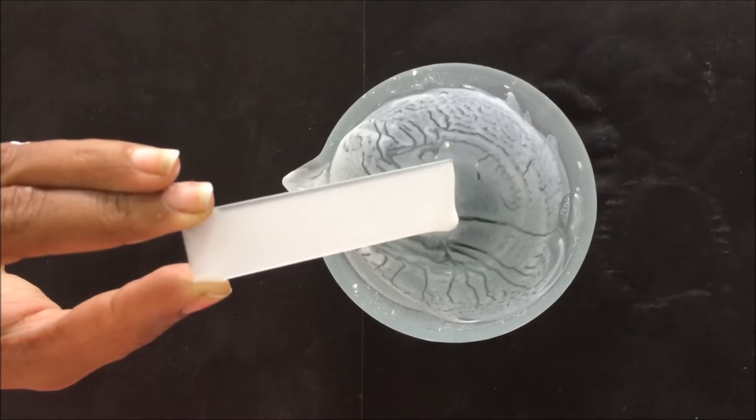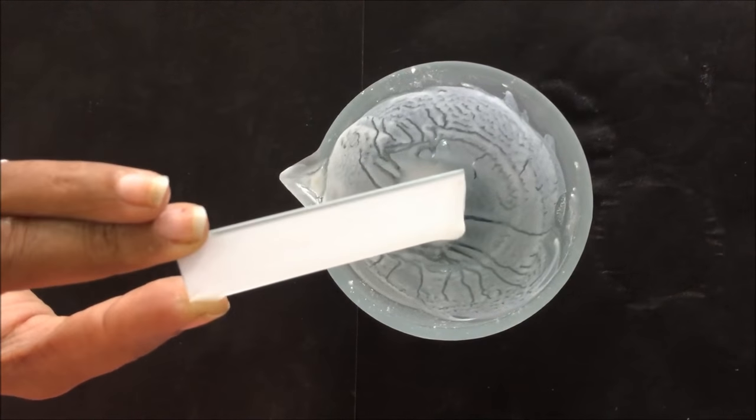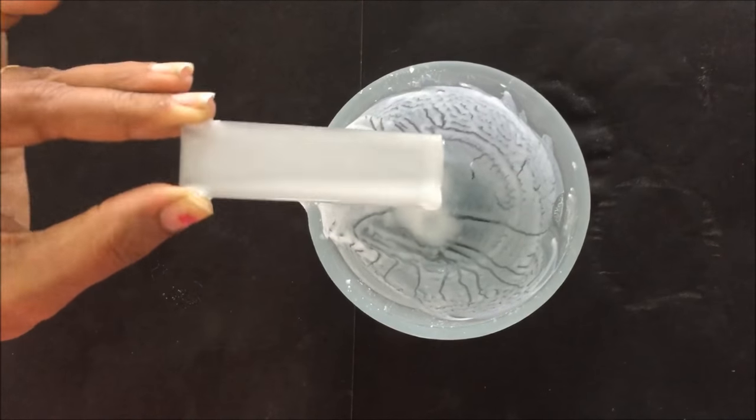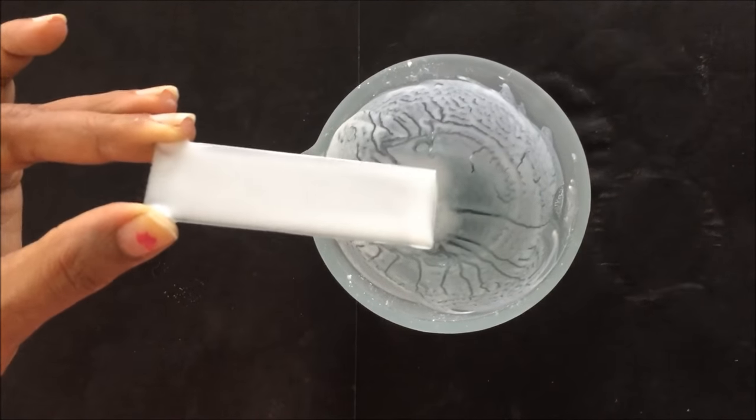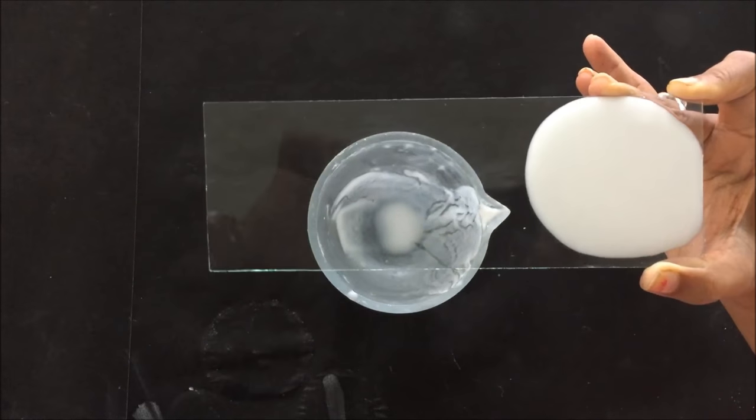Make sure that there should not be any uneven spot on the plate and remove the excess slurry over the plate. Similarly, you can follow the same procedure to coat the big size glass plate with the slurry.